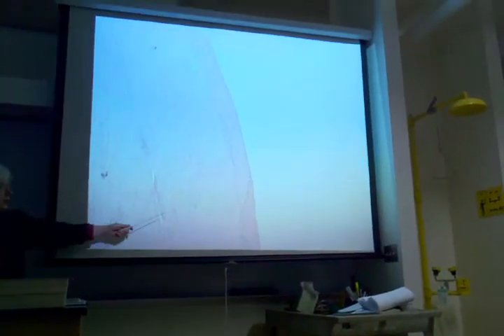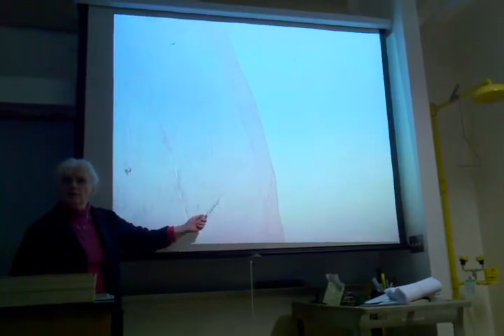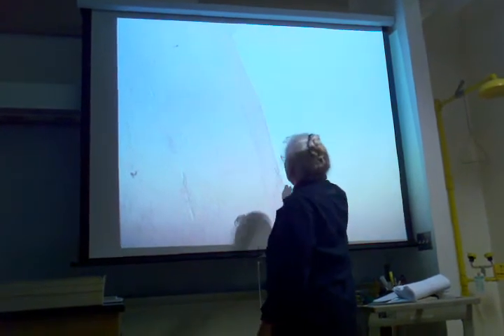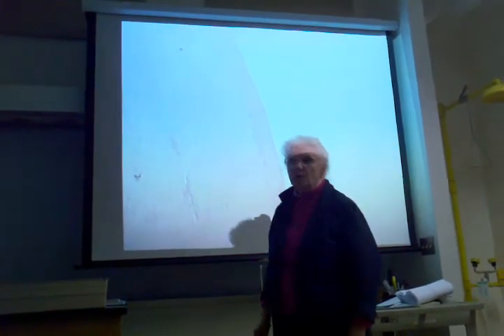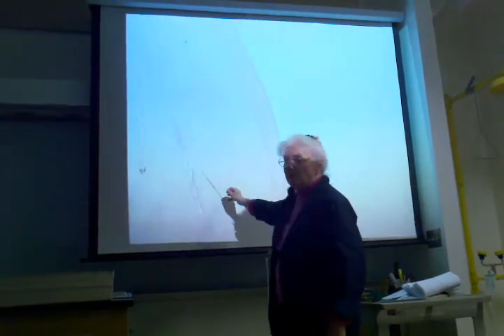So, okay, that's smooth. Now, I want you to see something. Let's go back to the ileum. Okay. What do you see here? Muscular. Muscle. This is muscularis. Now, on the outside, the very edge there is what kind of layer? That's serous. You have 2 different kinds of muscles here.